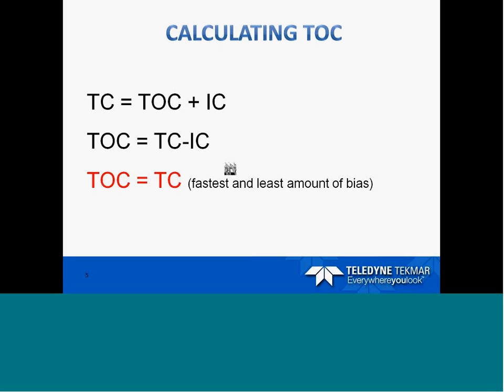So in all intents and purposes, the TC is equivalent to the TOC. The total organic carbon in there is equal to the total amount of carbon.